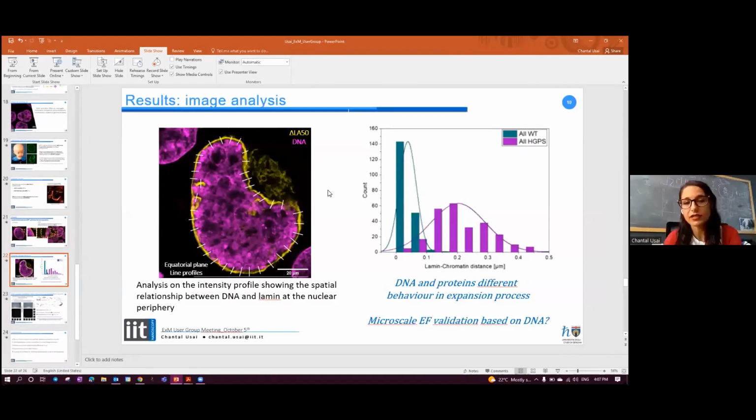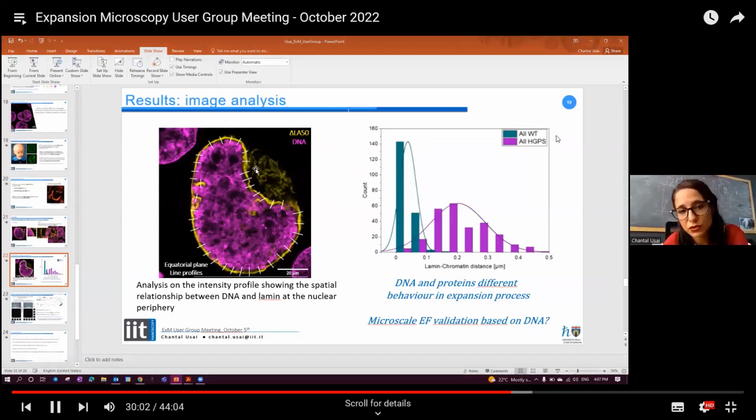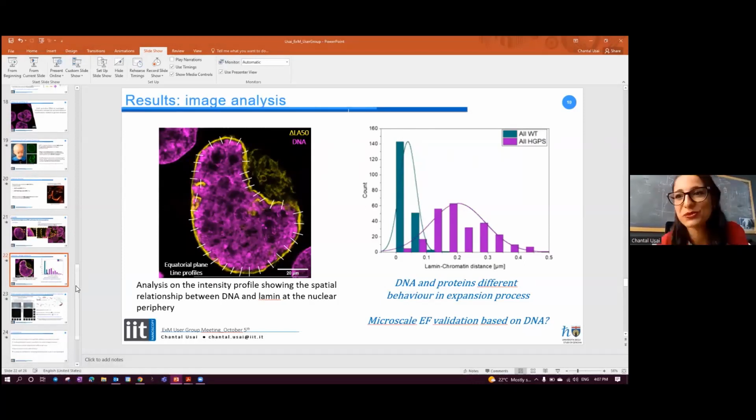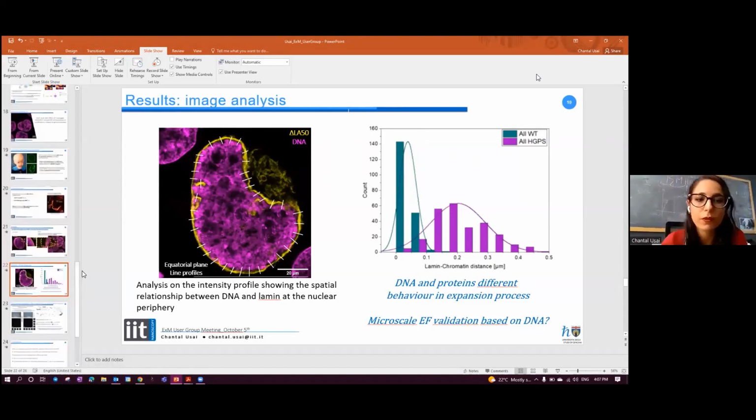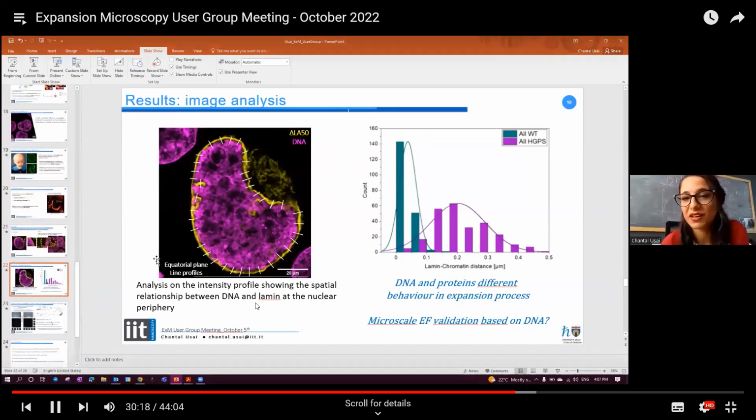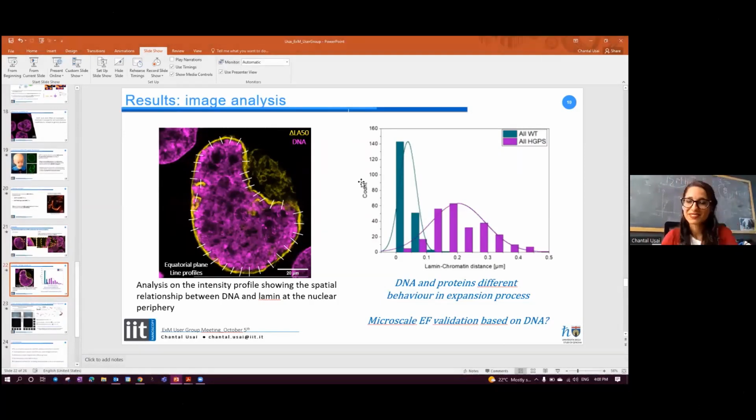I actually did that. Here, I just show you the one with the full DNA. I performed the image analysis only on this one for now, but I also stained the methylation modification on the lysine 9 of the histone 3. I didn't want to talk about my work too much because this wasn't the point of this meeting, but we would like to also study the modification in both heterochromatin and euchromatin in this biological sample that we are using now. Okay, thanks. You're welcome.